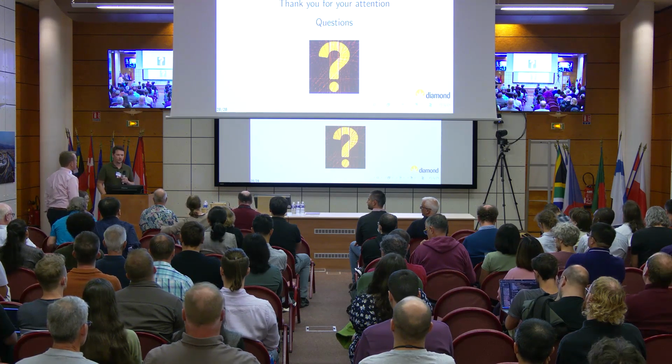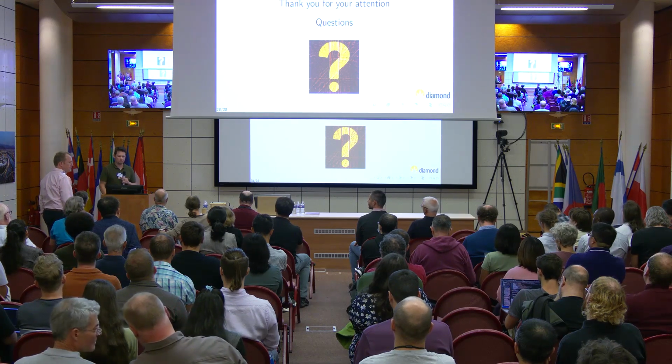So you talk about HTOM wrappers, which means that you would perhaps be able to integrate other backends rather than only the TomoPy one?